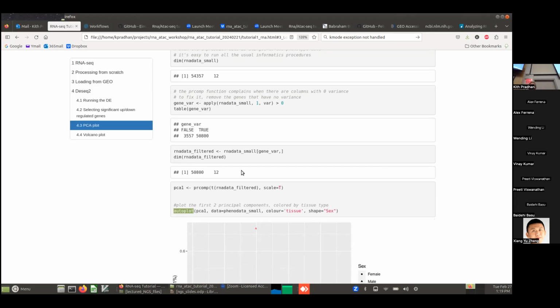You can always run PCA yourself. There's a function in R called prcomp, and you give it the normalized count matrix. You can run PCA, and then you can plot any version: you can do the first versus the second, first versus the third. If you have the PCA vectors, you can plot any one you want. I prefer ggplot2, but you don't even need to use ggplot2. But this is just an example of how you use this built-in function to make PCA plots very easy.